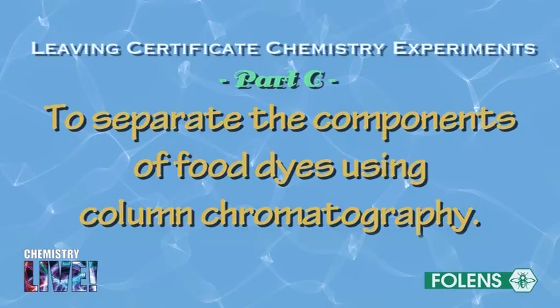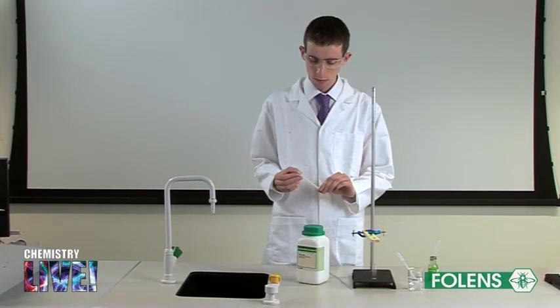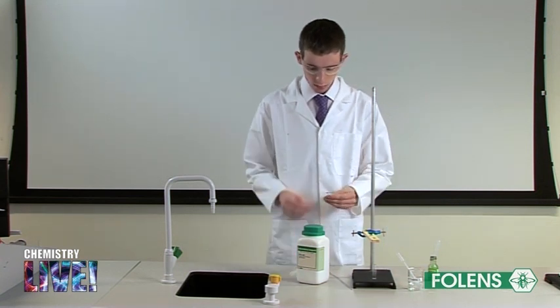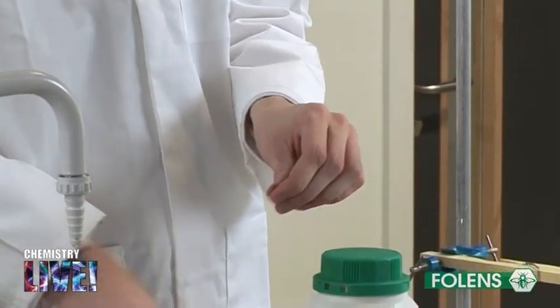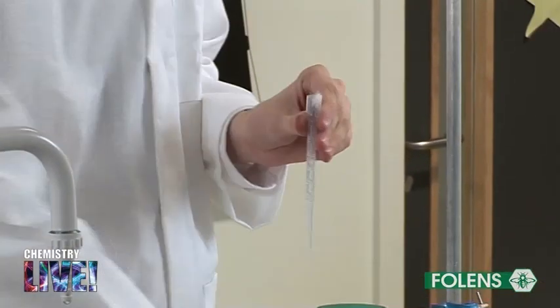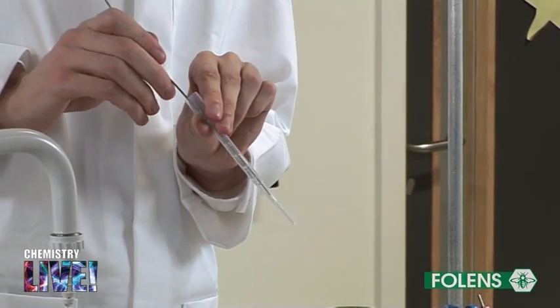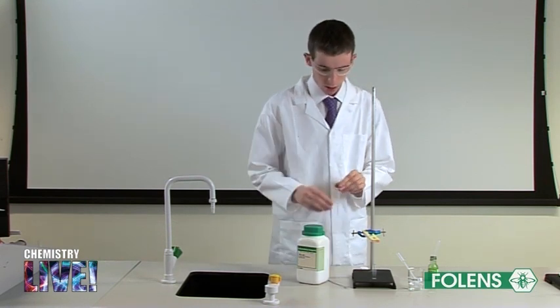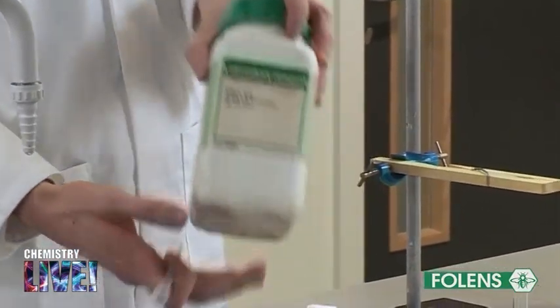Part C: to separate the components of food dyes using column chromatography. Using scissors, the tip of the bulb of a plastic dropper was cut off. With the aid of a piece of wire, a small wad of loosely fitting cotton wool is placed at the bottom of the plastic dropper. Fill the plastic dropper with silica gel up to the base of the bulb.